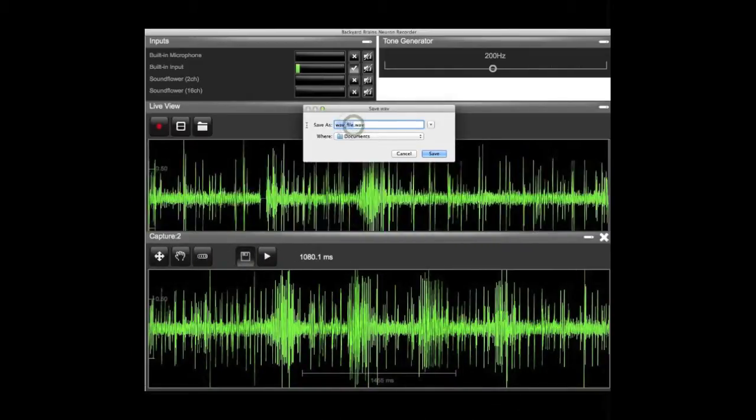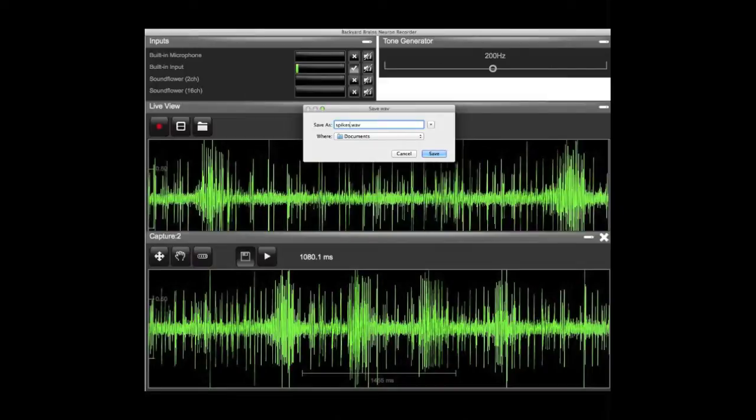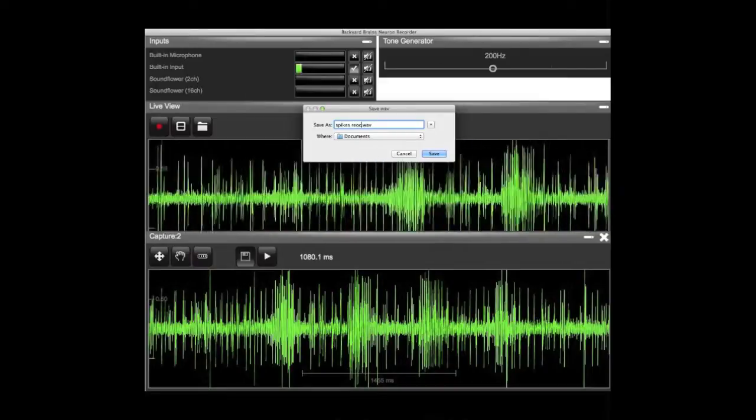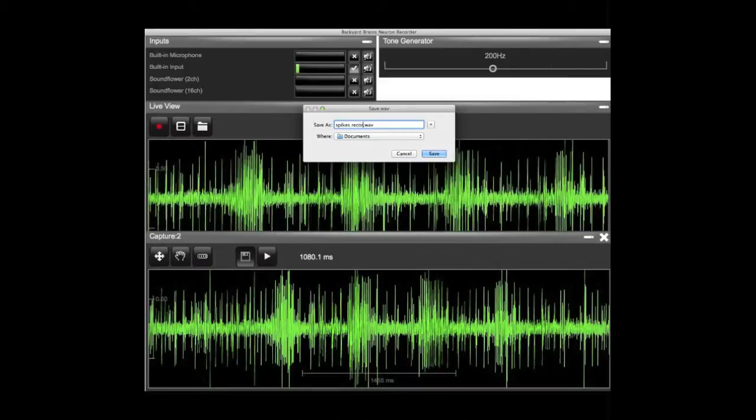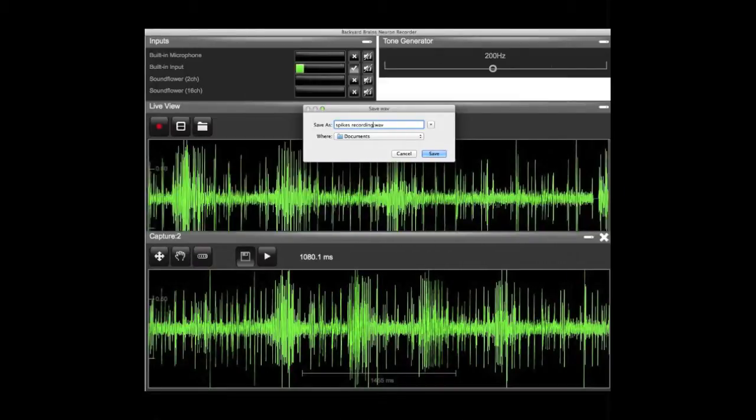You can also save your file for later analysis, as well as import it by clicking on the folder icon in live view.